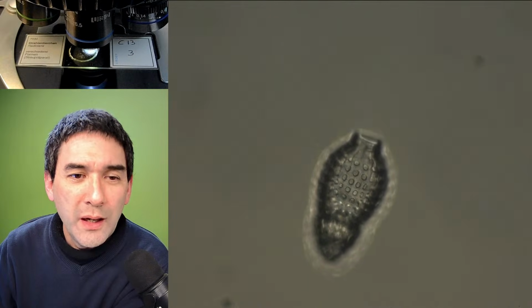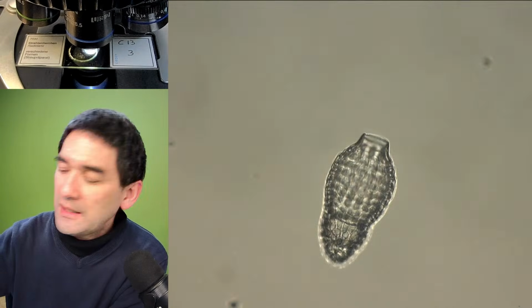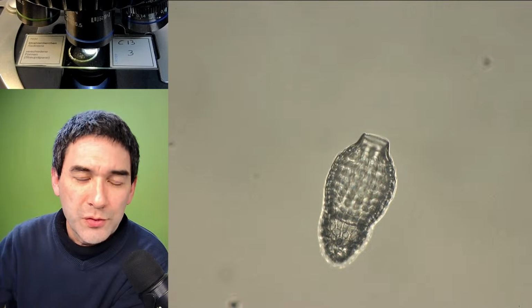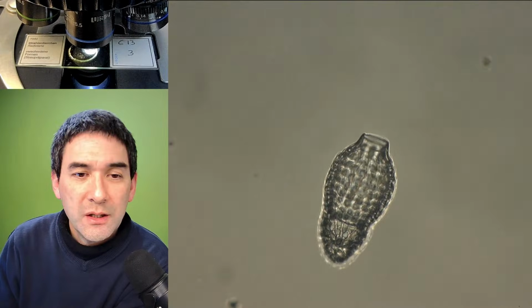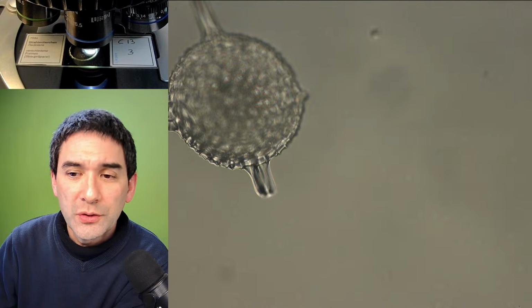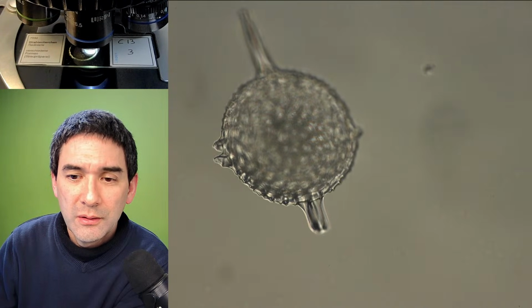If you wonder why sometimes the brightness jumps so abruptly, it is because I try to pre-program the intensity setting of the lamp of my microscope, but sometimes it starts to jump. Yeah. So that's essentially the different shapes that you've got here. Okay, here we go.